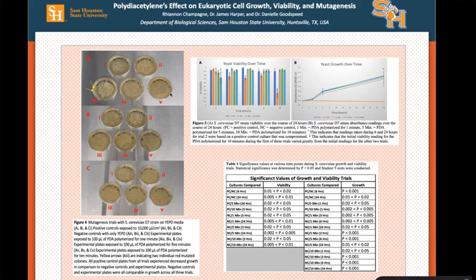And you can tell that in comparison to the positive control, you see a more comparable growth to the negative control. The positive control has a lot less growth in each plate. Now, one thing to mention is that we did see a little bit of background mutation or spontaneous mutation on the 1-minute polymerization length plate, and there were just a couple of very lightly colored red colonies.